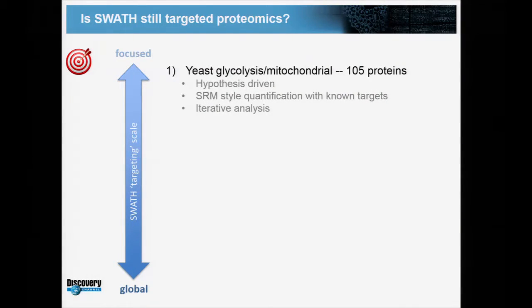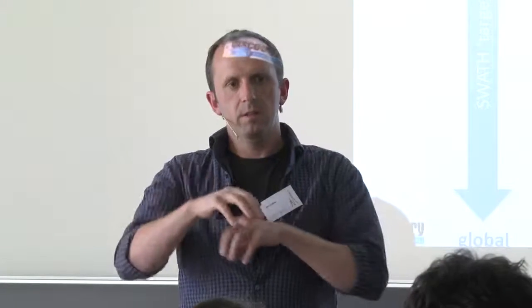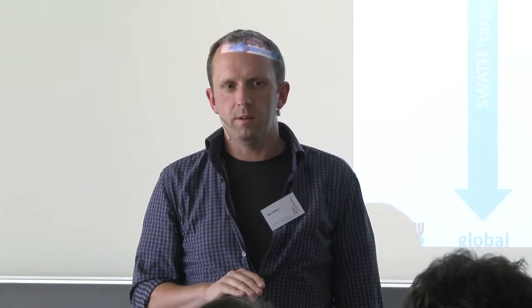Especially how you interpret the chromatography. Usually these two isoforms will not overlap in the chromatographic space. Because we have very complete data over the chromatographic time dimension, usually these types of peptides can be resolved in the chromatographic space. You just need to be careful that if you have both versions in your library, it points to the right one and not the other. Did I explain myself? Yeah, sure. Thank you. Anyway, more about PTMs from Ariel on Friday.